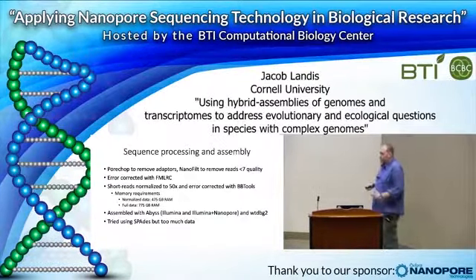And doing that actually helped a lot with our computational requirements. So to assemble in Abyss with the normalized data required only 475 gigabytes of RAM. Doing the full data set took over 700 gigabytes of RAM and would take 4 days just to read in the data itself. Whereas with the normalized data it took about 2 days. So it does help to remove that repetitiveness if you don't need that in assembly.